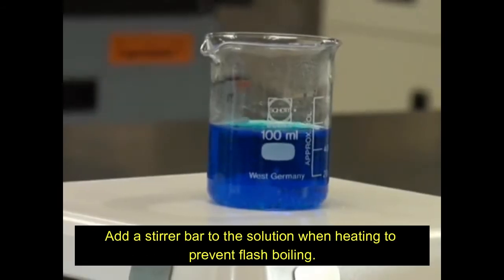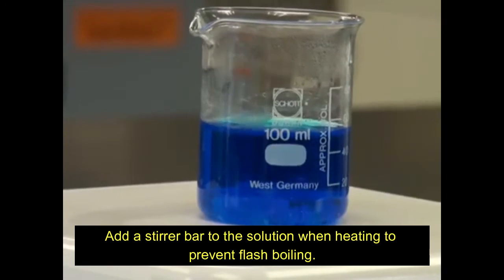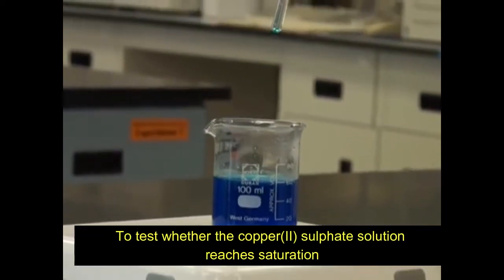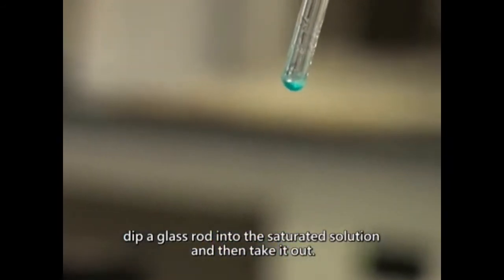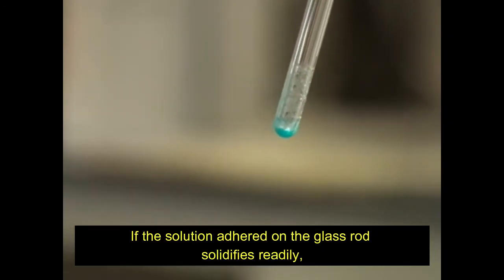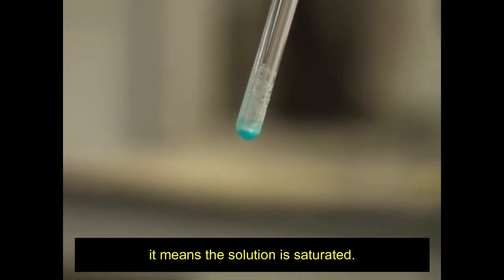Add a stirrer bar to the solution when heating to prevent flash boiling. To test whether the copper 2 sulfate solution reaches saturation, dip a glass rod into the saturated solution and then take it out. If the solution adhered on the glass rod solidifies rapidly, it means the solution is saturated.